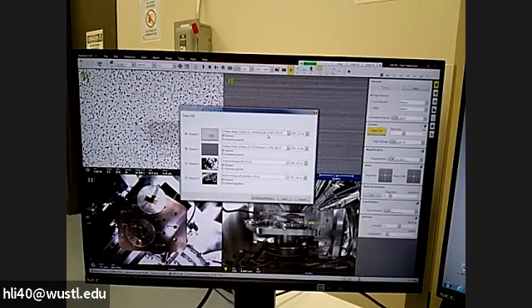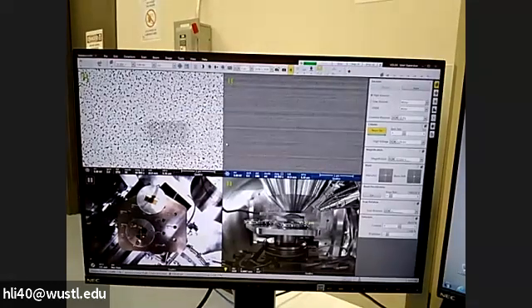It's sample 2. If we like, you can change this to 001. If you don't change it, that also works, or you can delete that one. So just save it. All right. So this is how we play.